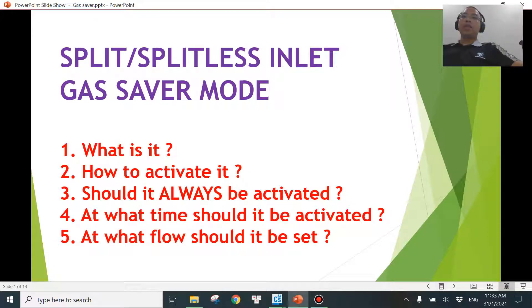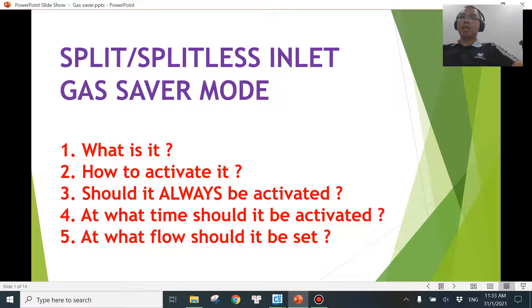Hi, welcome to another video. In this video, we will be covering gas saver mode for the split/splitless inlet. A couple of questions we will be going through include: what is gas saver mode, how to activate gas saver mode, should it always be activated, and what time and flow rate should we turn on gas saver mode.